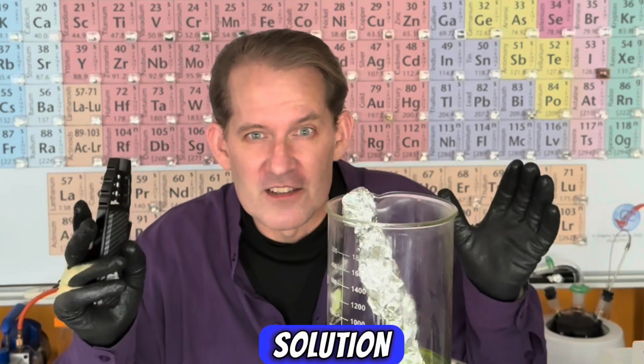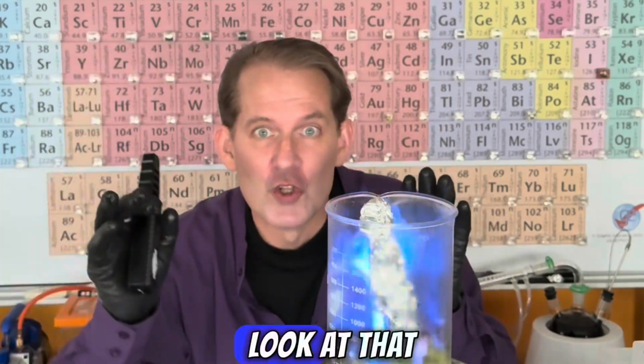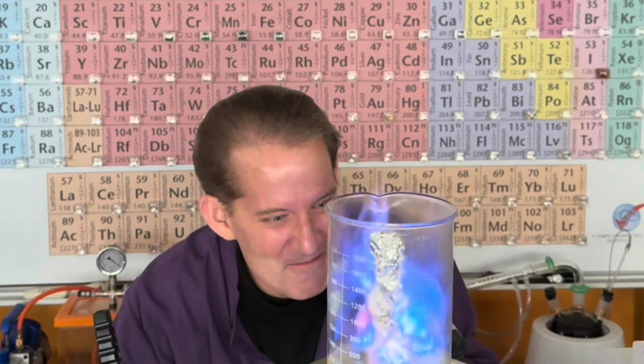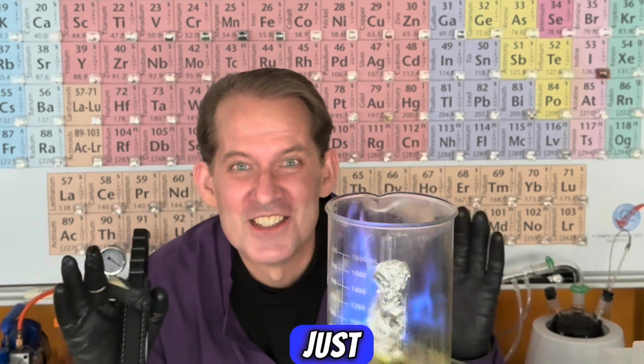That acidified solution starts to break down the aluminum and release hydrogen gas. Watch what happens. Look at that amazing blue flame. Isn't that awesome? It is gorgeous. Beautiful blue. Just amazing.